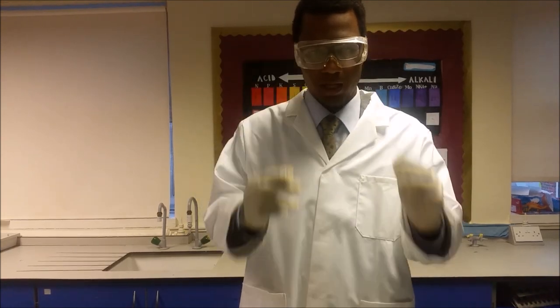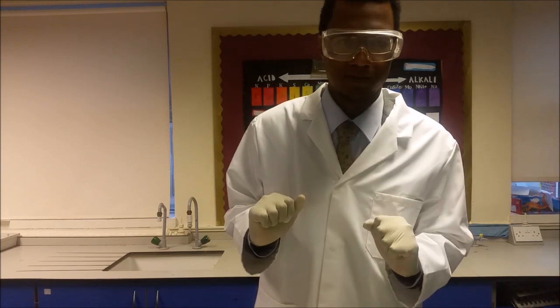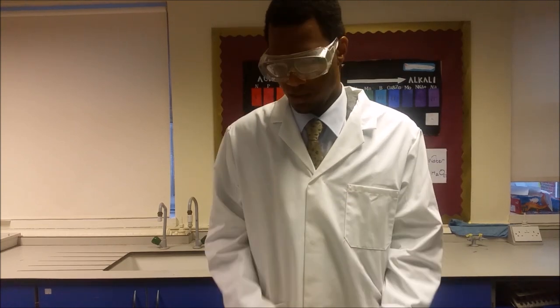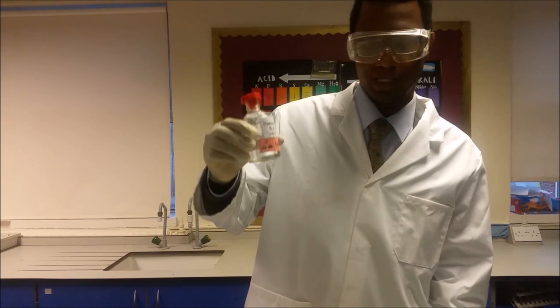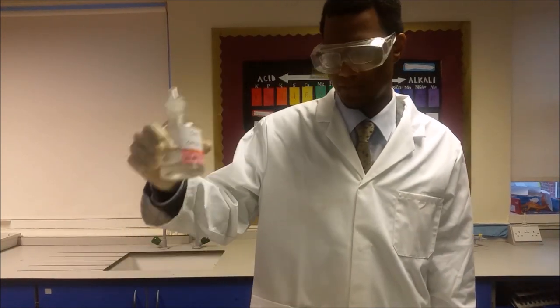The safety instructions for this are wearing goggles, and it's always safe to wear a lab coat and some gloves — that will keep you safe. Note that hydrochloric acid is corrosive, as well as sodium carbonate.